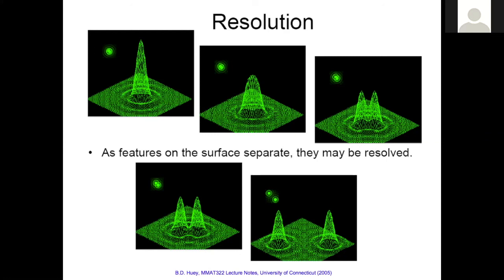Then this, getting further apart, is very clear. Definitely we have two peaks, we have two features. So this is the physical resolution. This is the fundamental resolution.